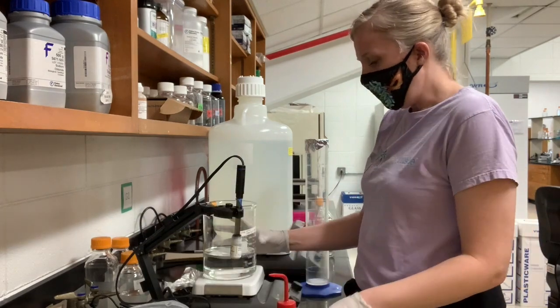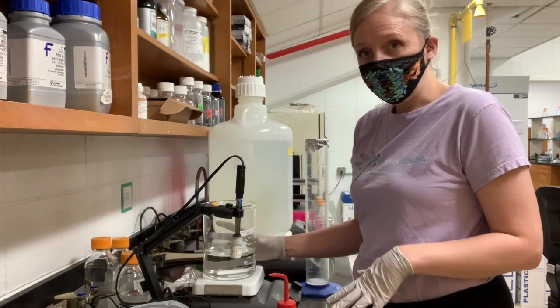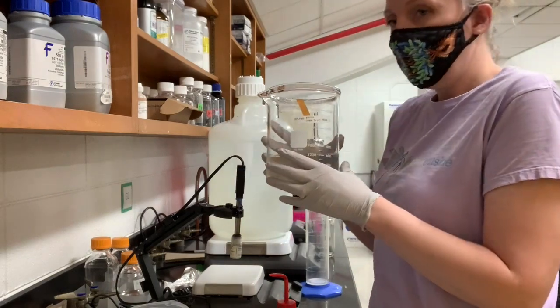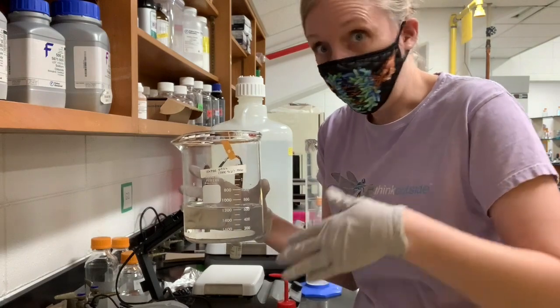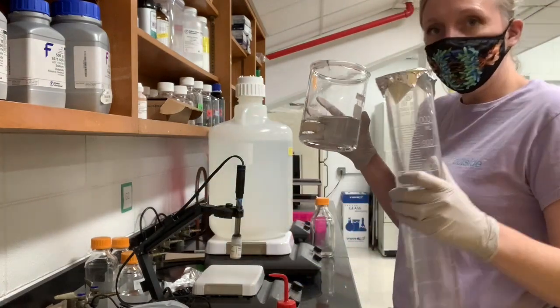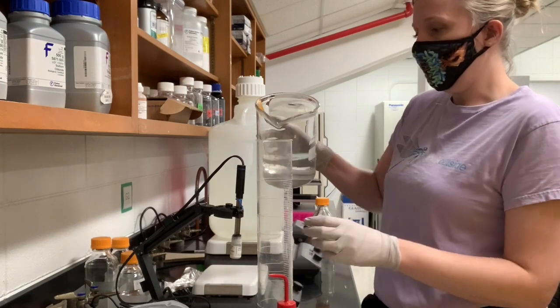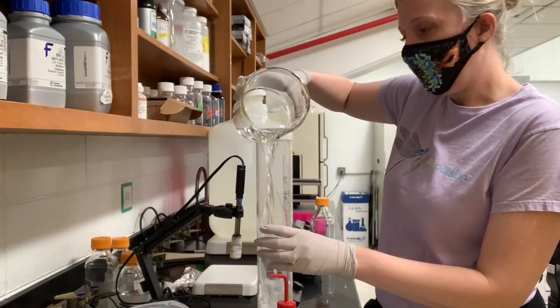Okay, so now I have my solution. It has the right components. It's been pHed to the right pH. And the last thing I need to do is add water to bring it up to 1 liter. So as I mentioned, we start with a little bit less than 1 liter because we don't want to end up with 1.1 liters. And so I'm going to use a graduated cylinder, which is more accurate for volume, to pour the solution into. And then I will go fill it up with water to 1 liter.